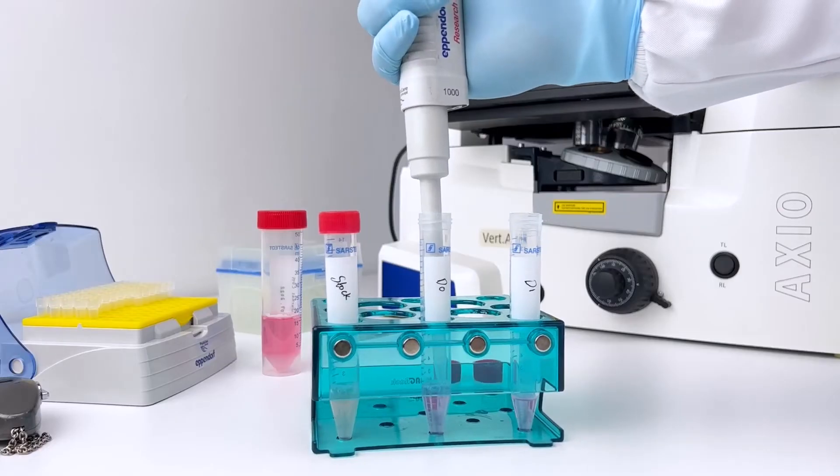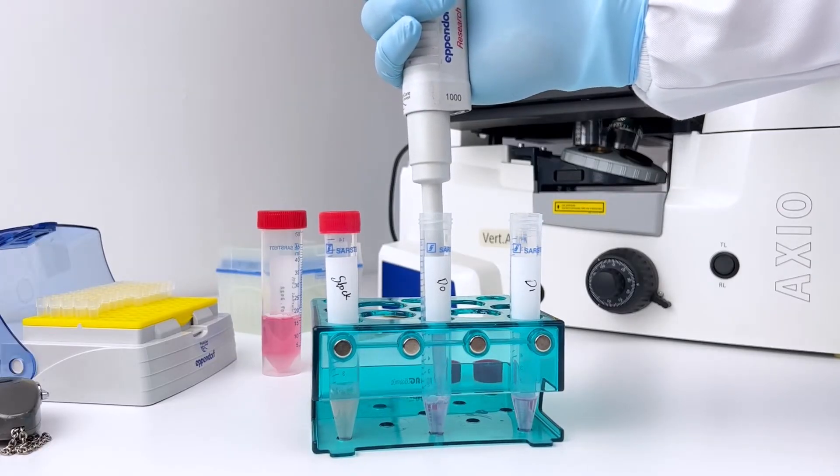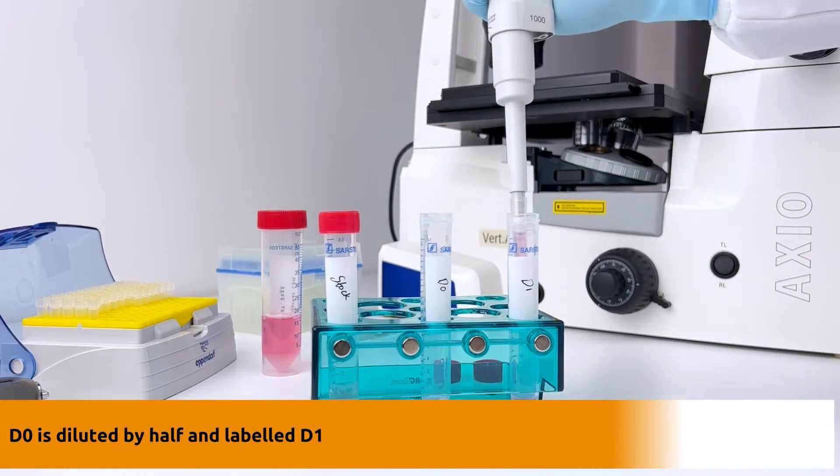With D0 prepared, the next step is serial dilution. D0 is diluted by half and labeled D1.